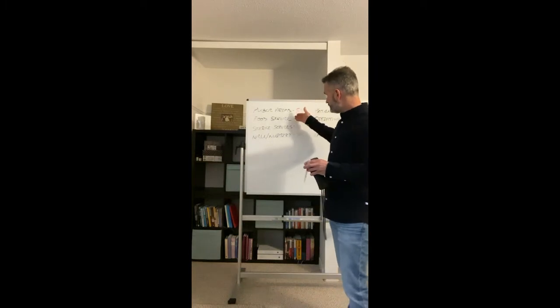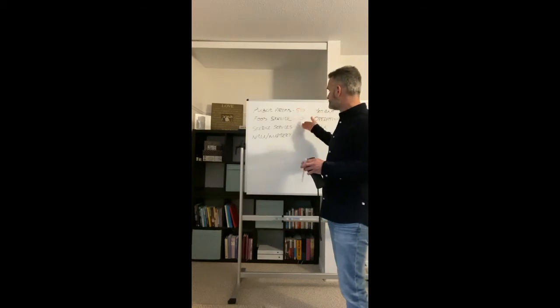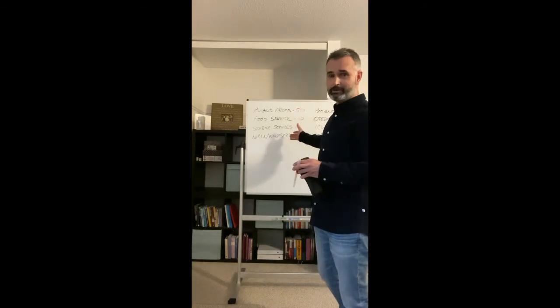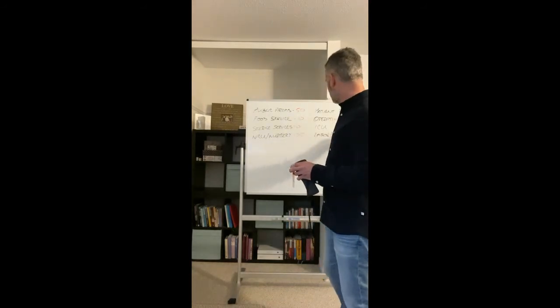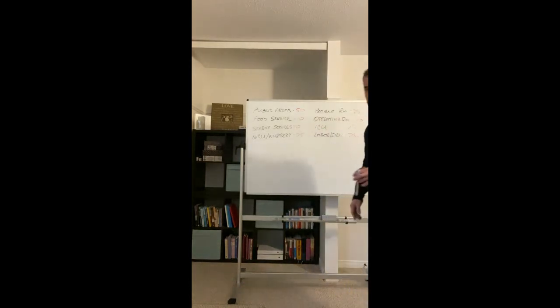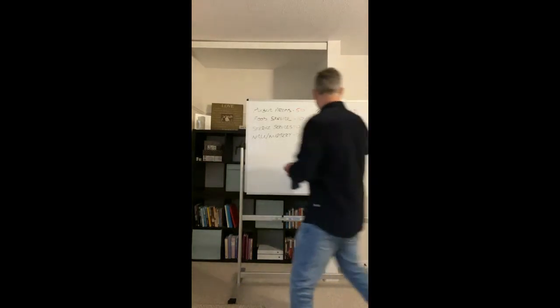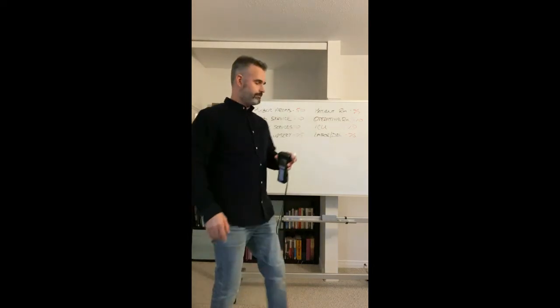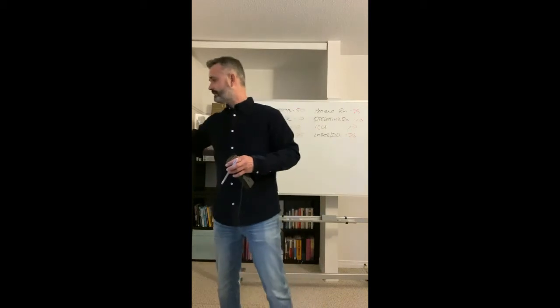So now we get into food service, that'd be a 10. Like a food prep area, you'd have to be a 10 or lower. Sterile services, again, 10 or lower. NICU nursery, you'd probably think that would be a 10. That's actually a 25. Same with labor delivery, 25. ICU, 10. Operating room, 10. Patient room, 25.